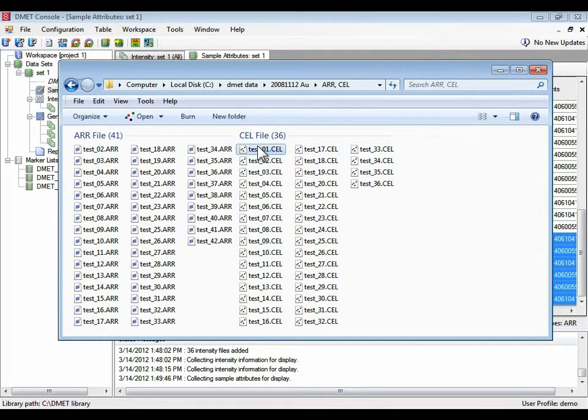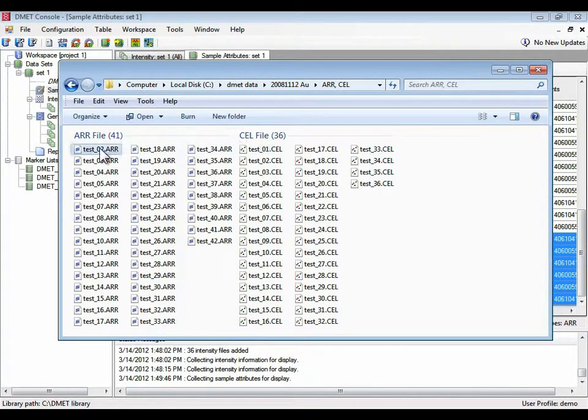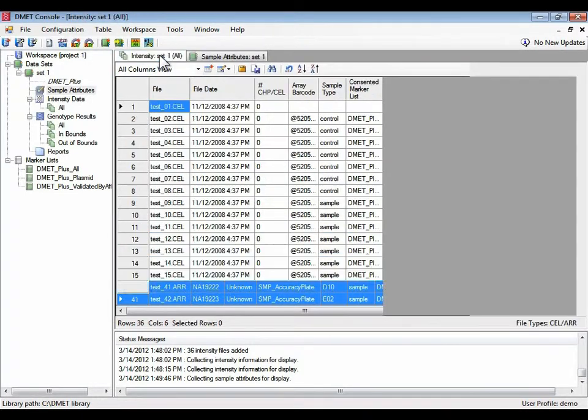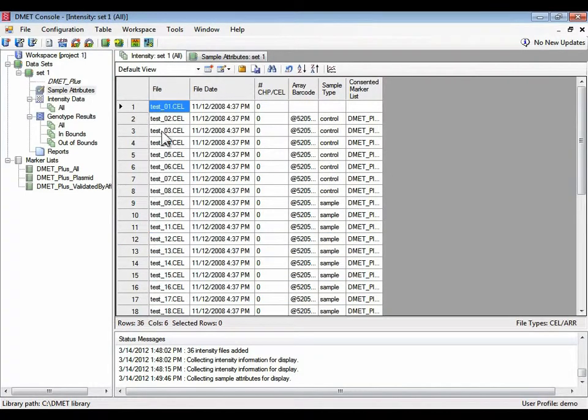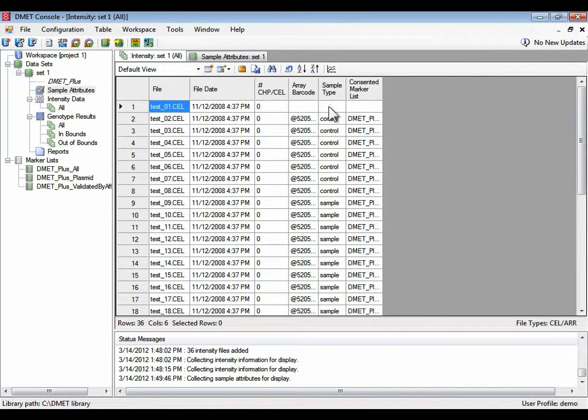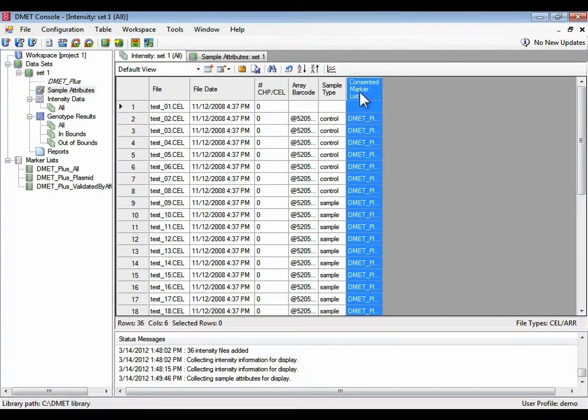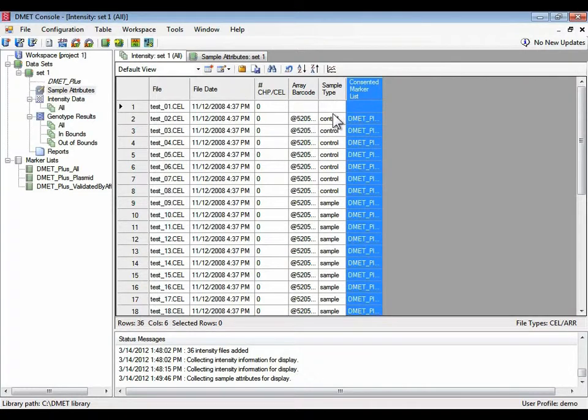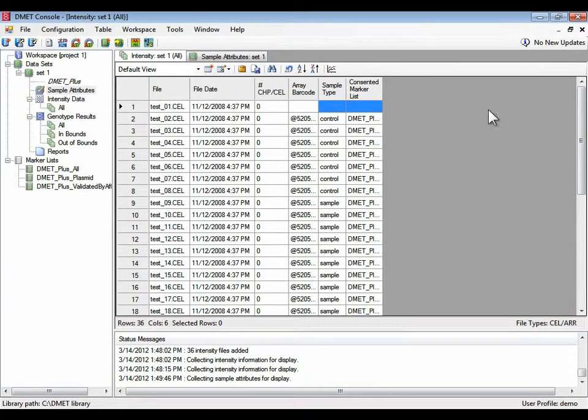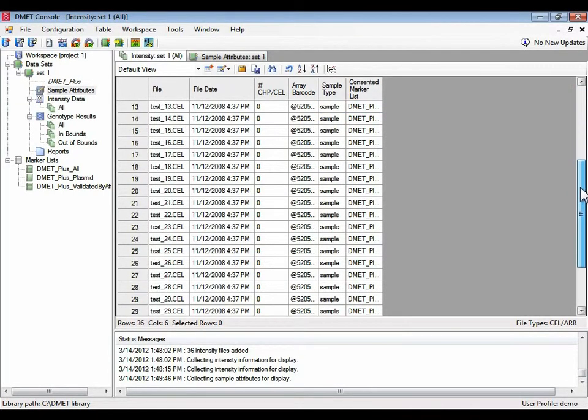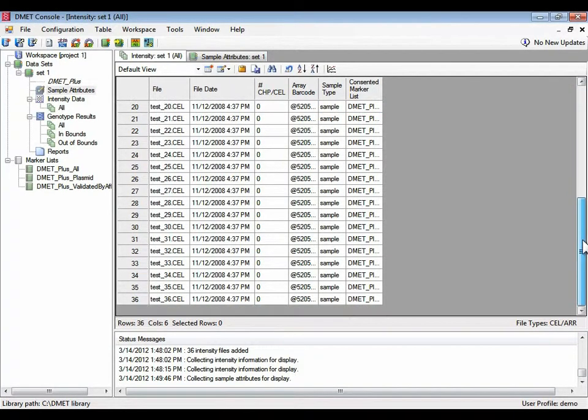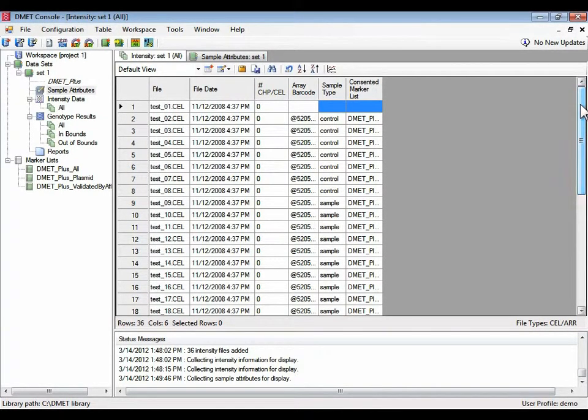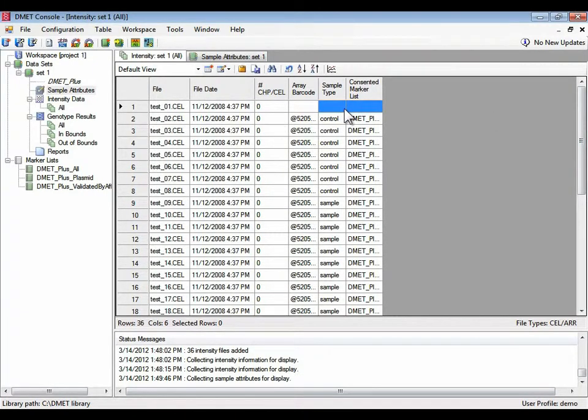To detect this other problem, a cell file that has no associated ARR file, you can go to the cell file tab. The information here, sample type and consent and marker list, which are two of the fields that are available from the sample file, show no information for this first cell file. That's a good clue that the ARR file hasn't been loaded with this. And you'll see the consequences of this later.